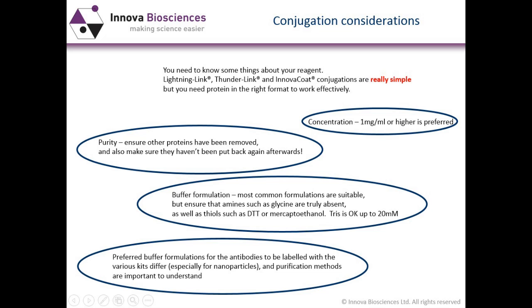You also need to think about the buffer formulations of the antibodies, and note that different kits, especially conjugation to nanoparticles, can have different buffer requirements and purification methods than for conjugation to enzymes.